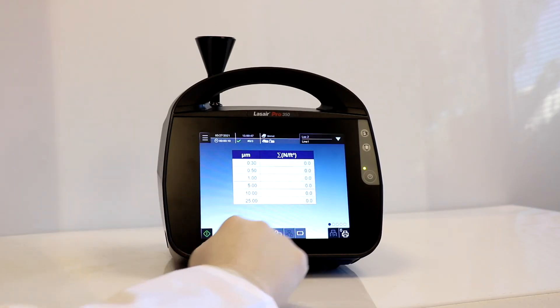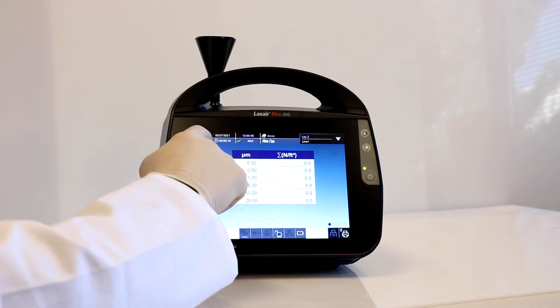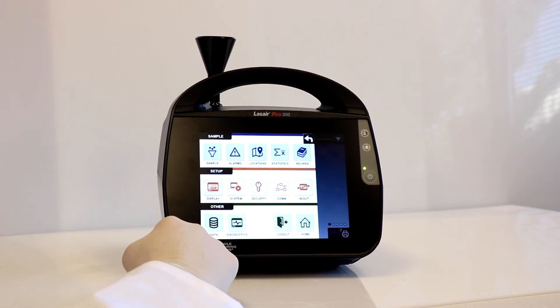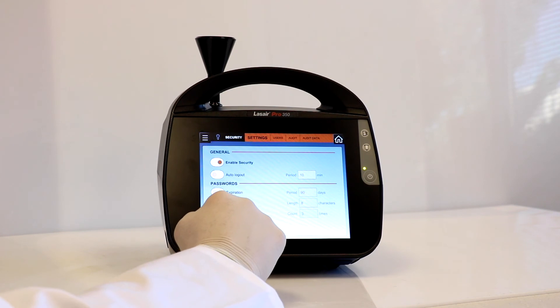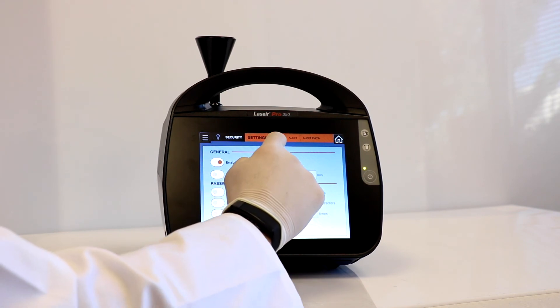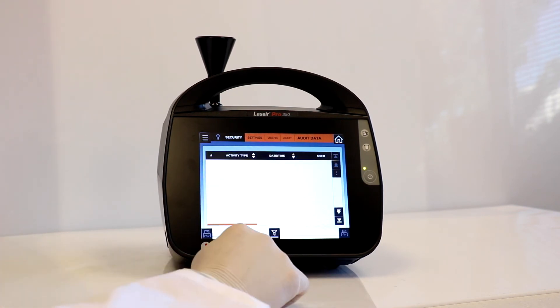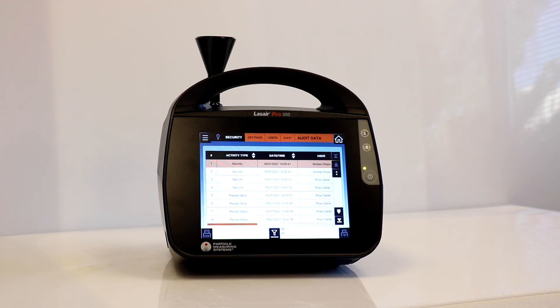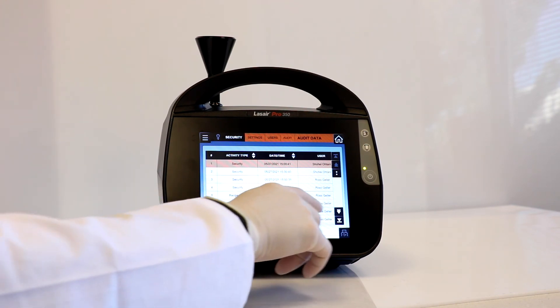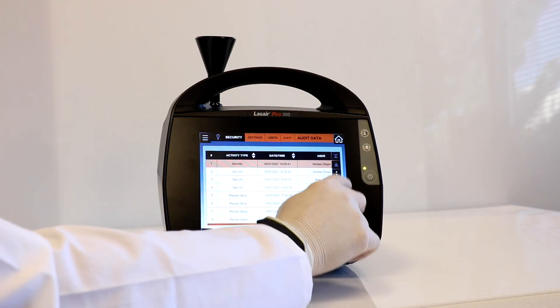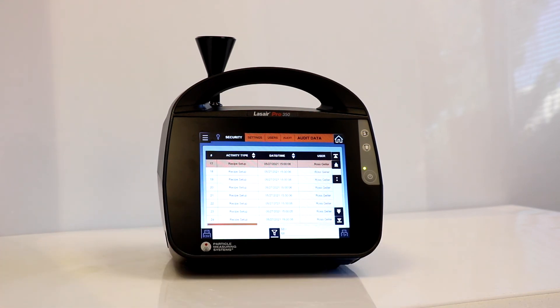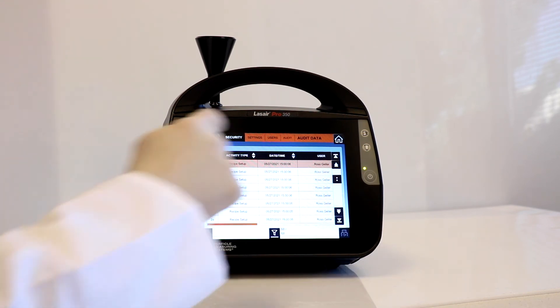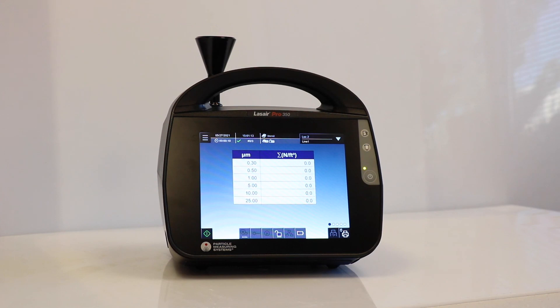Navigate back to the menu and select the security icon. To review the audit data, select the audit tab. In this screen, you can access the audit data with all the functions we have performed. Here, you can filter data by operator, date and time, and activity type.